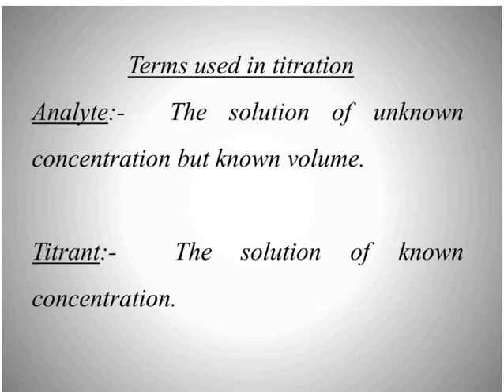You know the terms used in titration, and these terms should be very clear to you, crystal clear, so that you will not face problems during your titration. So it should be visible to your brain and to your eye. What is analyte? The solution of unknown concentration but known volume. What is titrant? The solution of known concentration.